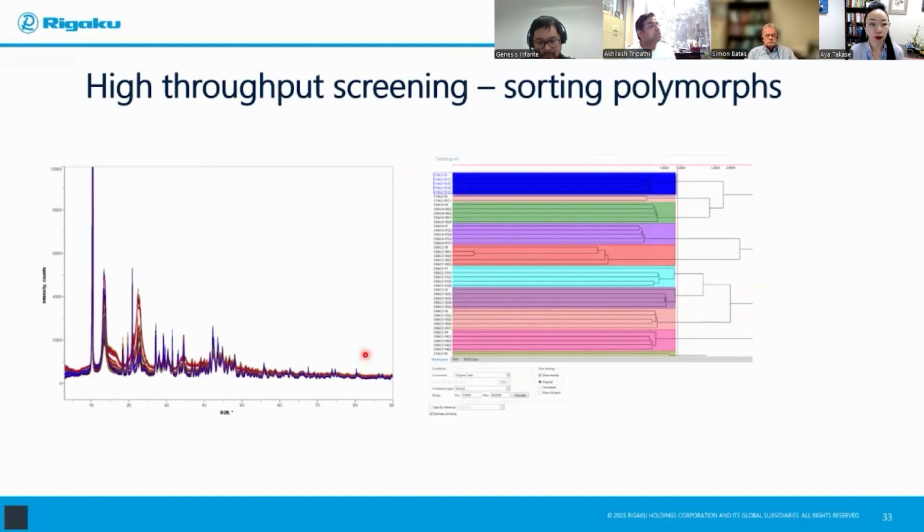So you can use cluster analysis and use a threshold bar. You can see we employed a threshold bar to classify these clusters. What you generate is what we call a dendrogram, or a tree diagram. It organizes the data into clusters. In the dendrogram, the data located nearby have a high degree of similarity. Conversely, the data which are far from each other have a very low degree of similarity.